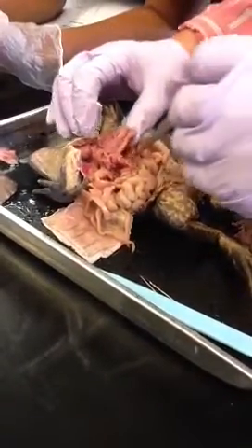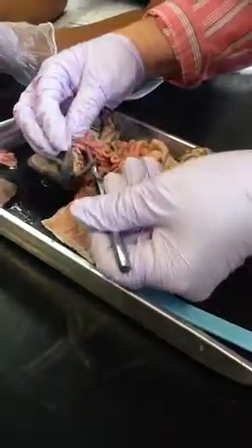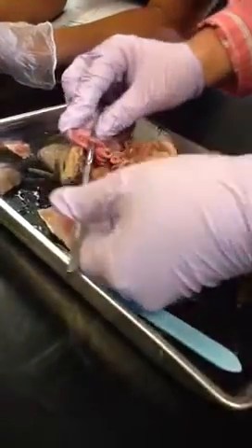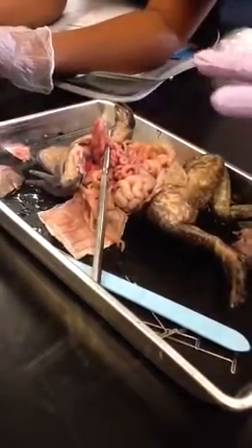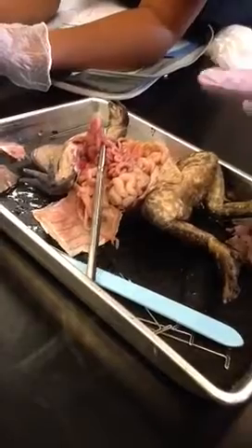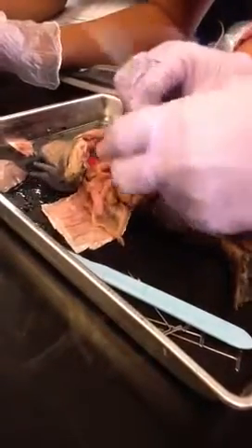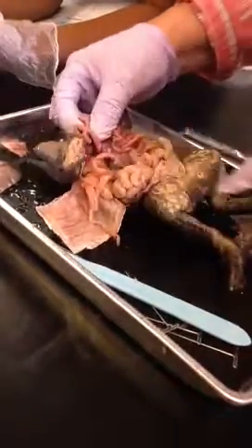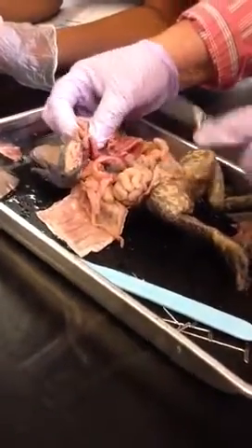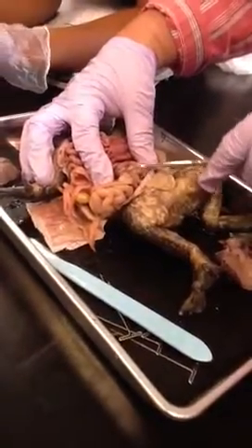And if you look under here, we can find a real thin piece of tissue. That's the pancreas right there. It kind of falls between the stomach and the small intestine. Okay, so you follow the small intestine around, and it coils and it coils and it coils, and then it terminates in this tube right here, which is the large intestine.